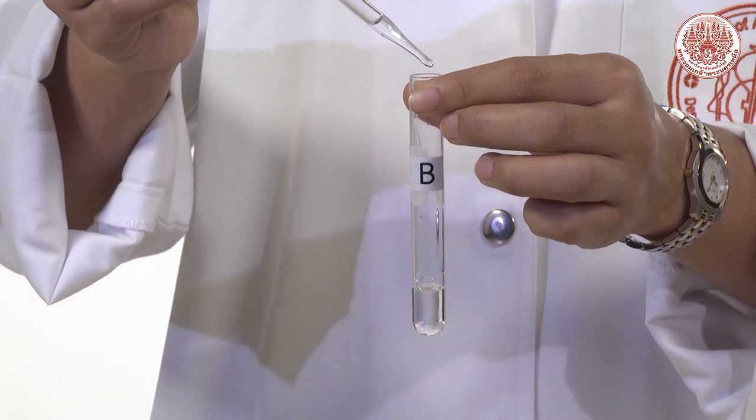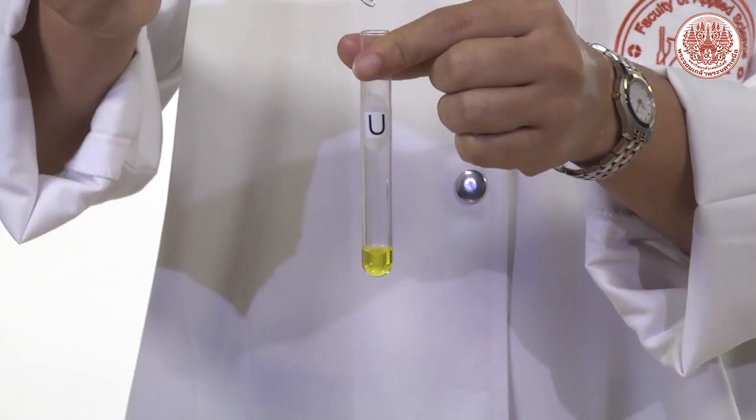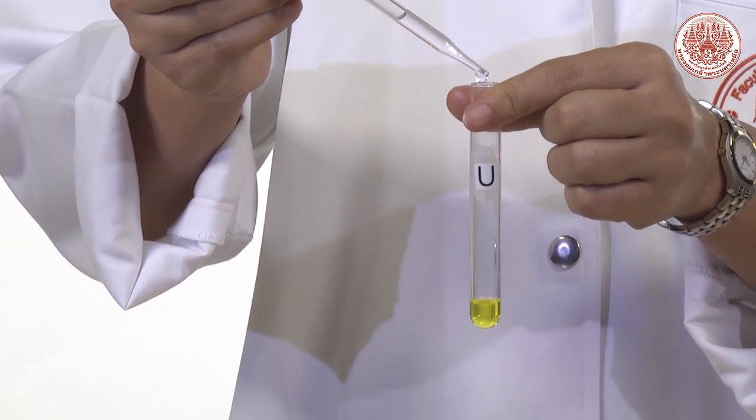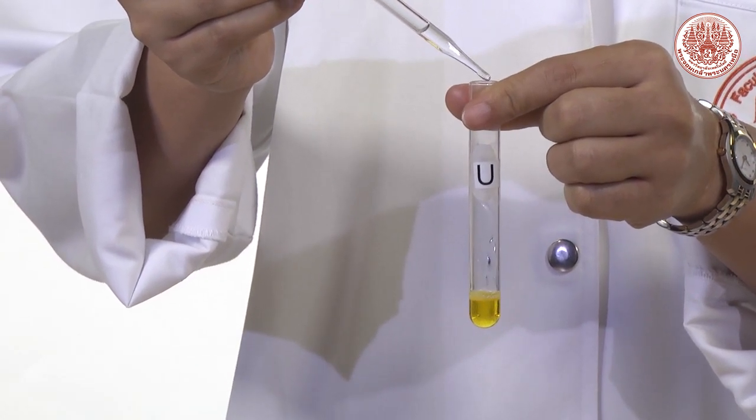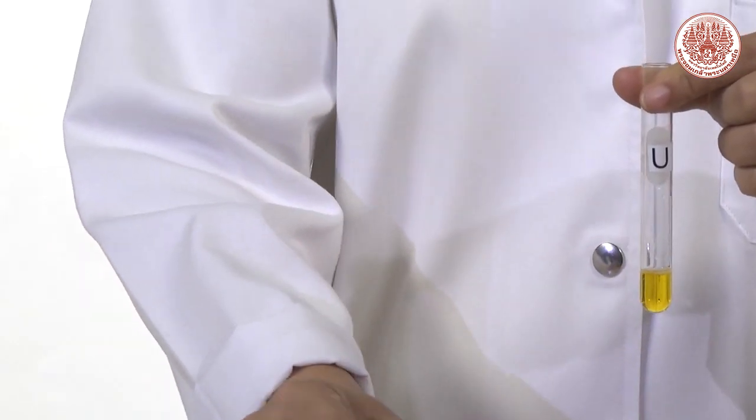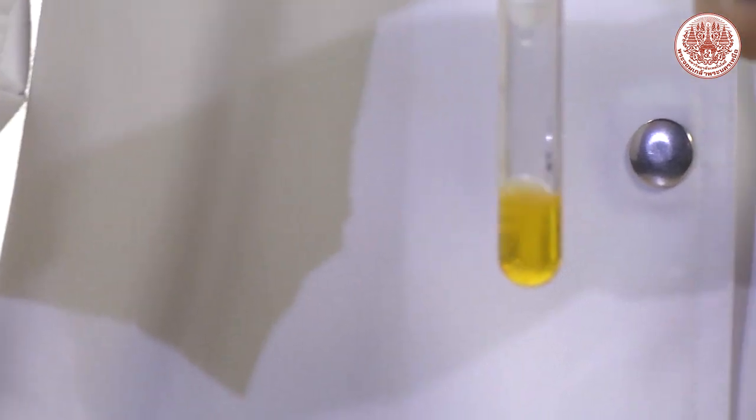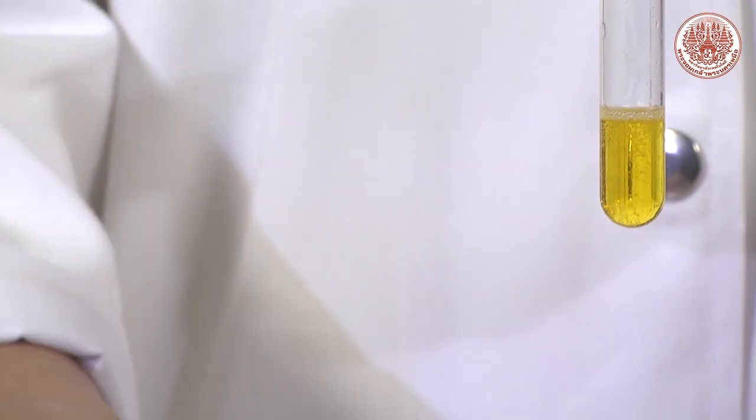If no bubble is formed in the U tube, meaning there are no carbonate ion in an unknown sample. Keep in mind, if students observe less bubbles than that in C tube, it also means that positive test occurs.